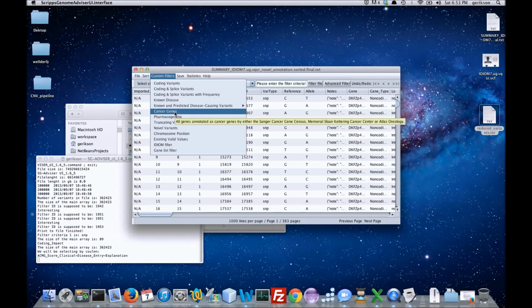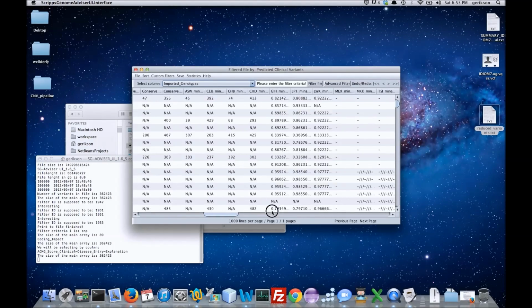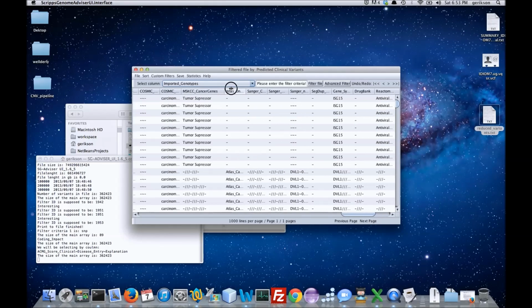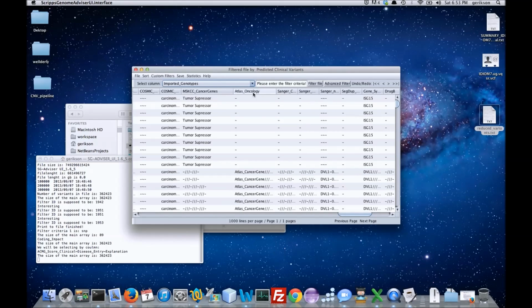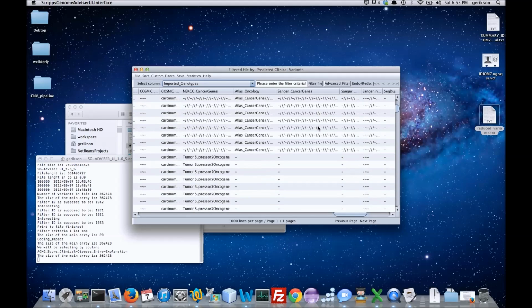Custom filter. Let's say we're interested in cancer genes, which are filtered by 3 different columns, which are the MSKCC, Atlas Oncology, and Sanger cancer genes.